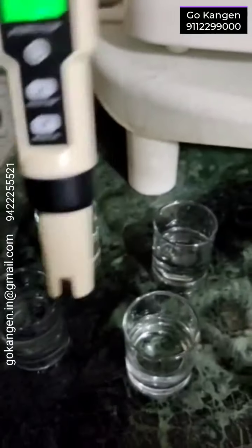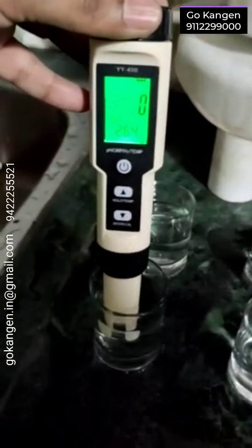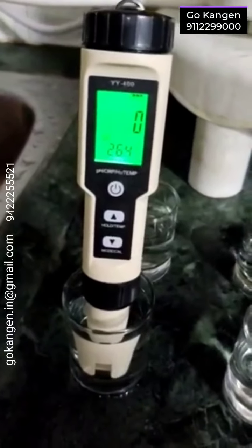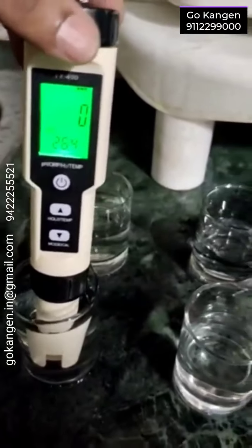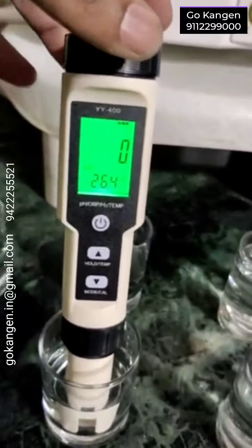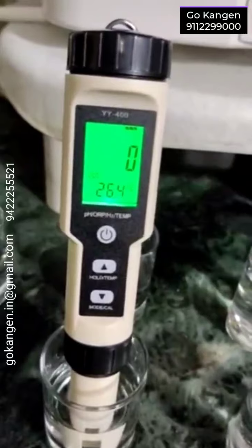Most important is hydrogen. So let's first test — is there any dissolved hydrogen in tap water? No, it is showing zero. Let's check in 2.5 — obviously, it is also zero.